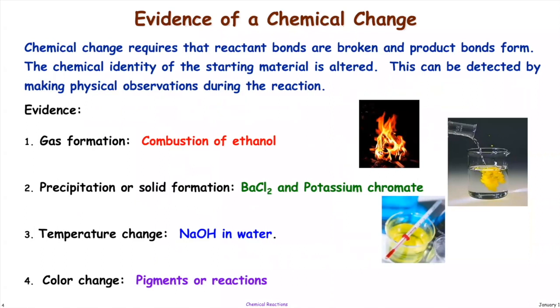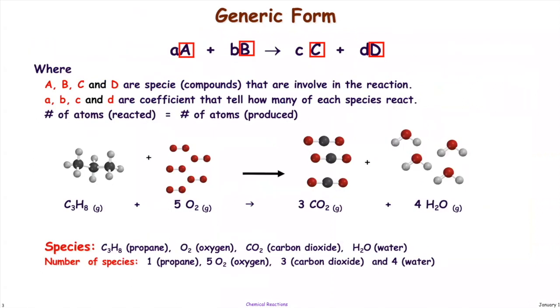Excuse me, Professor. Yes. So about the rubbing alcohol thing, I'm able to substitute hand sanitizer for it? Yes, you can. Right. I'll show you that demo, okay? So yeah, you can do that. The only reason why you have rubbing alcohol is to make sure it burns so you can see the combustion reaction.